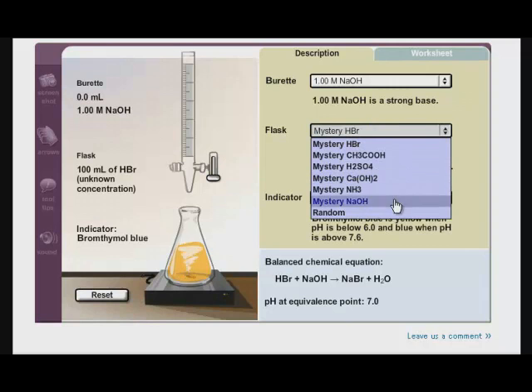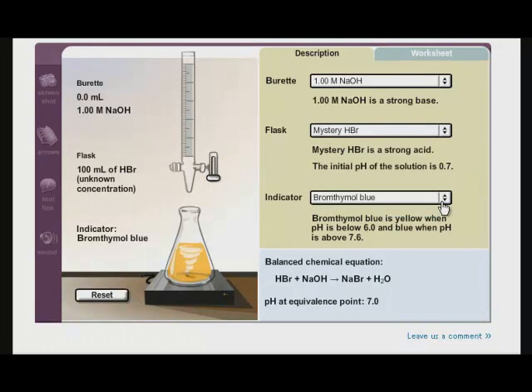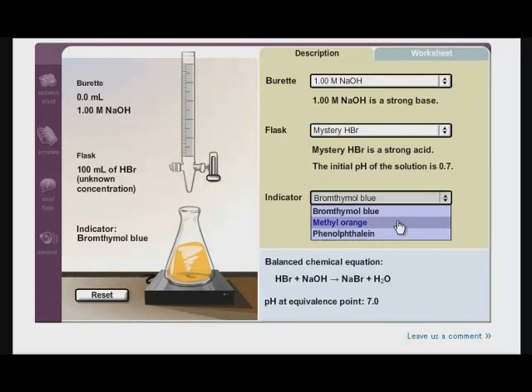Your analyte you will not know the concentration of, but you can pick or you can even choose. It will give you a random analyte. And then you can also change the indicator that you will be using in the titration.